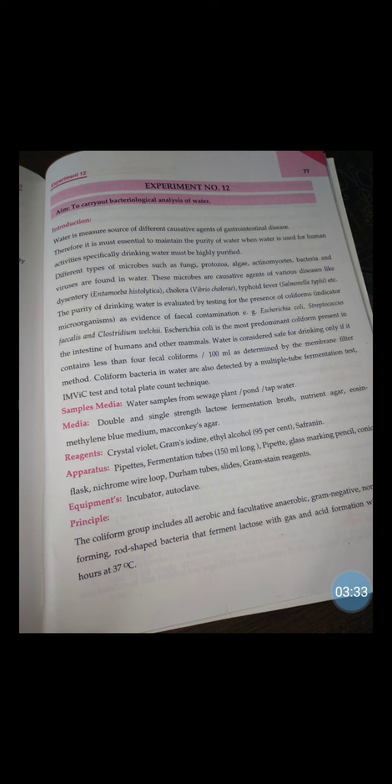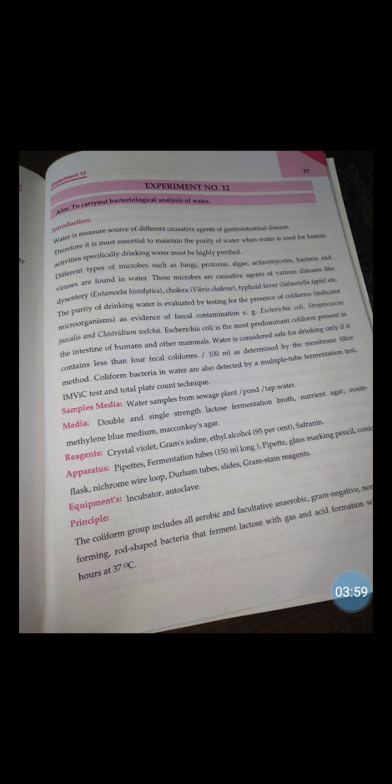Then we will see the principle of this practical. The coliform group includes all aerobic and facultative anaerobic, gram negative, non-spore forming, rod-shaped bacteria that ferment lactose with gas and acid formation within 48 hours at 37 degrees Celsius.